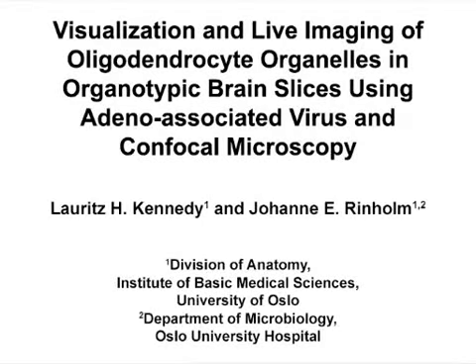The overall goal of this viral transduction and time-lapse recording is to visualize movement of oligodendrocyte mitochondria in organotypic brain slices. This method can help answer key questions in the oligodendrocyte field, such as how the oligodendrocytes and their organelles respond to changes in the local environment.